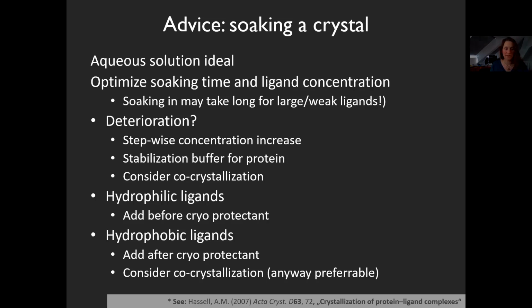Hydrophilic ligands, add them before you add the cryoprotectant. Hydrophobic ligands, add them after the cryoprotectant, because most cryoprotectants are pretty hydrophobic. I mean, speaking of cryoprotectants, right? They're not hydrophobic on a grand scale of things, but they're more hydrophobic than water. Consider also, again, co-crystallization.